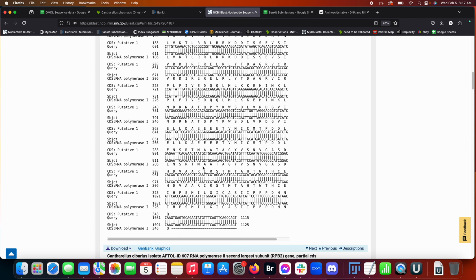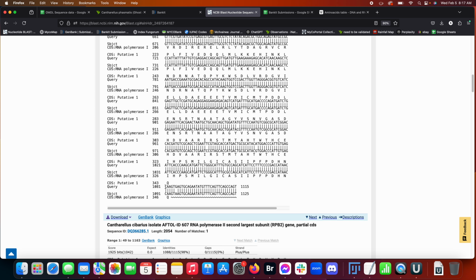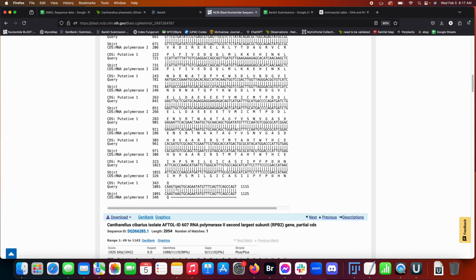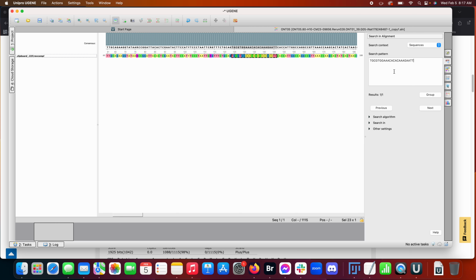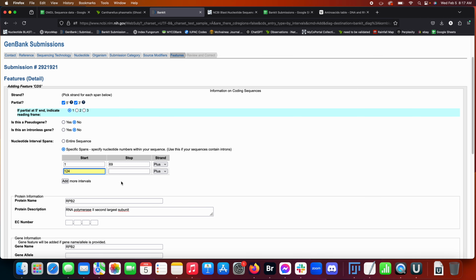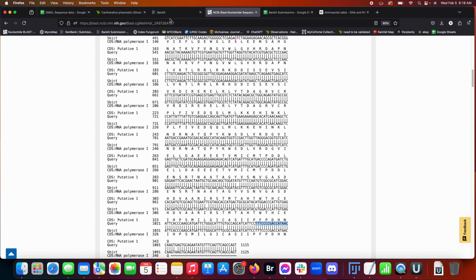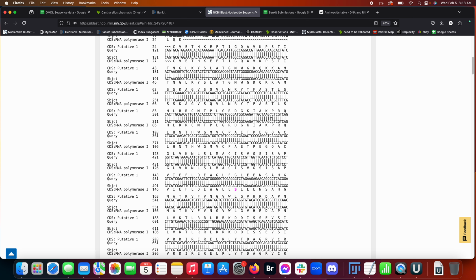And then we get a long intron. Okay. I'm going to double check that Q is CAA, CAA, Q. So I know that, I'm going to use that, and then CAA. So that is 1083. And then that should do it. That is a long intron.